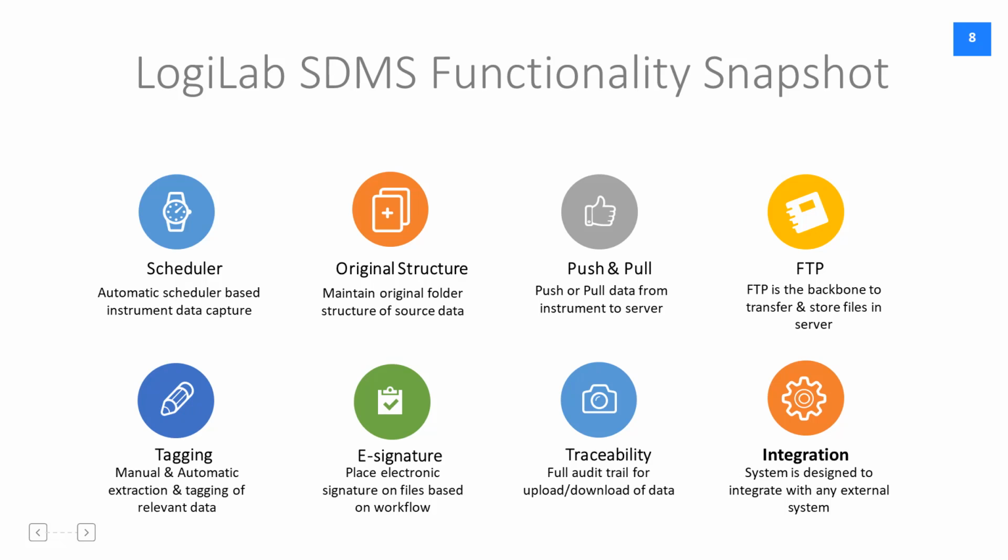LogiLab SDMS has full traceability. It has a built-in audit trail for recording uploading of data, downloading of data, restoring of data. All of these activities are 100% audit trailed with date and timestamp, along with who did what and when and why. The audit trail contains events with respect to upload of data, download of data.